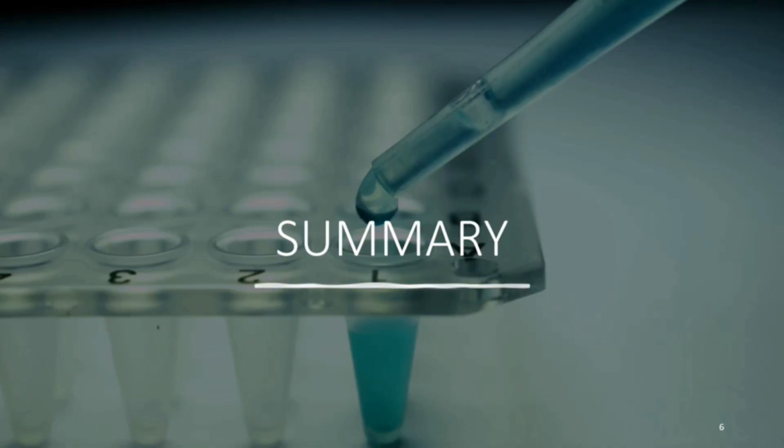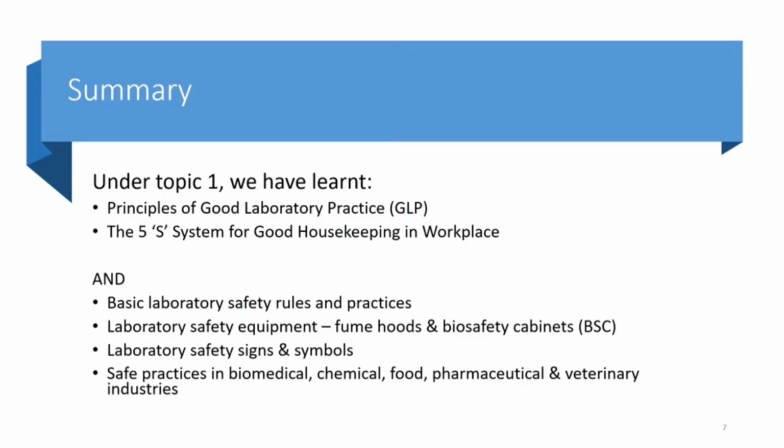Okay, we have come to the end of topic 1. To summarize on the topic 1, these are the things we have learned. Firstly, the principles of GLP, the 5S system for good housekeeping in workplace. And we also have covered quite a bit on the laboratory safety, which includes the basic laboratory safety rules and practices. Examples of lab safety equipment, namely the fume hoods and biosafety cabinets. Some of the common laboratory safety signs and symbols. And lastly, we have talked about the importance of following the safety practices in the various industries.